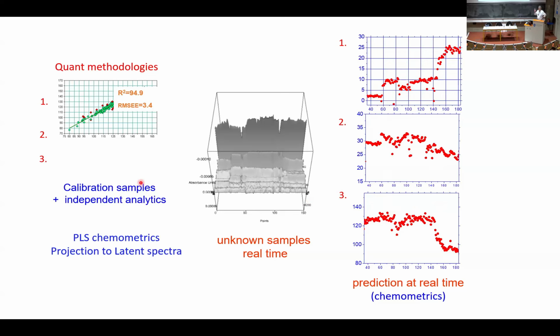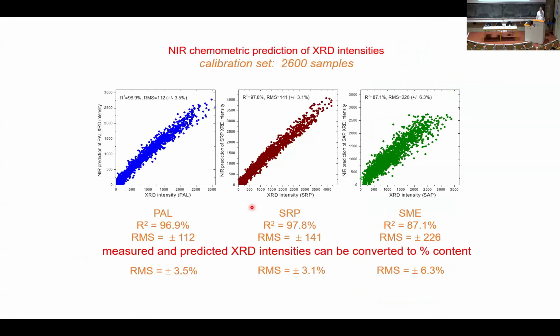I will not tell you much about what these properties are, but I can tell you that in this way you can make predictions for properties like methylene blue score, because companies measure methylene blue, nobody else would measure methylene blue, but that's what is available. You can measure water content against the calibration values. You can measure carbonates and a few other properties. You can do some other things also.